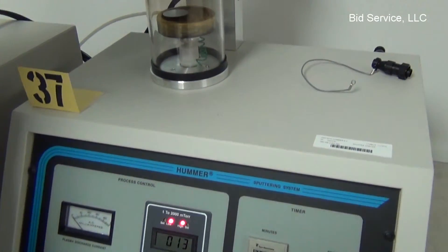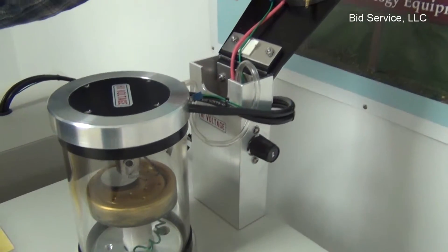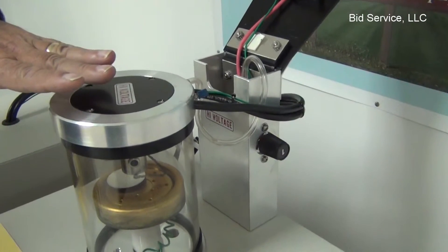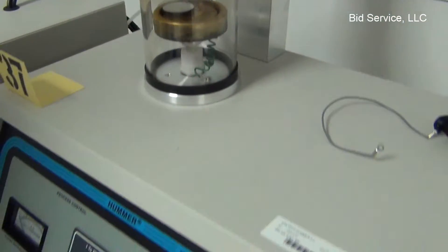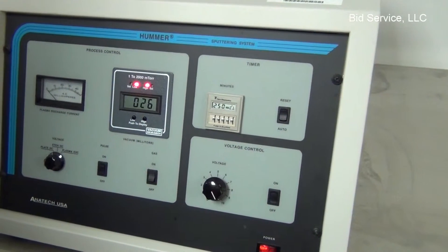This is what would normally be connected to the head of the Hummer. It is now connected to the head of the CEA, which has your carbon rods in it. We're at 13 milliTorr, so I'm going to increase that to about 100 milliTorr, turning the gas on.